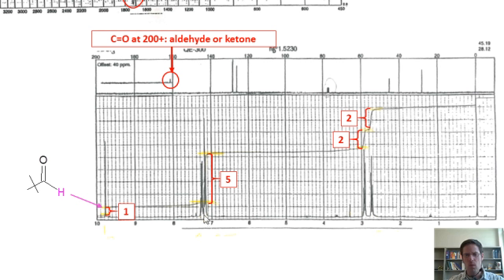So how in the world can I get a benzene ring that only has 5 hydrogens on it? Well, of course it has to be a benzene ring that is monosubstituted. This is not a T-butyl group, by the way. This is just representing some substituent, I don't know what it is yet, dangling off of my benzene ring. I've got 1, 2, 3, 4, 5 hydrogens left, and they're all heaping up on top of each other in aromatic land.